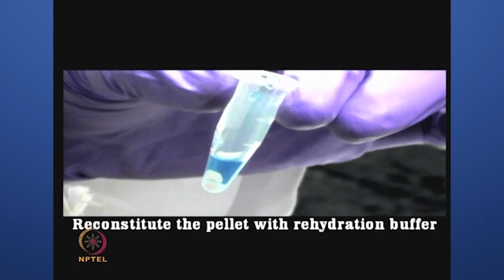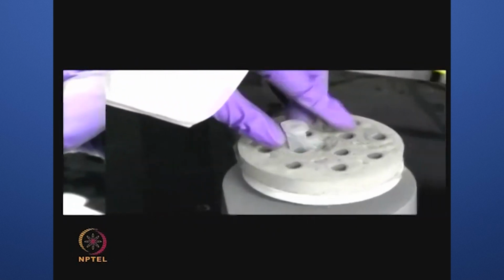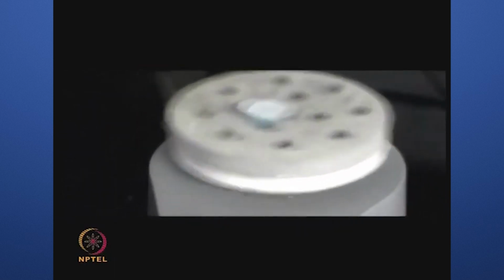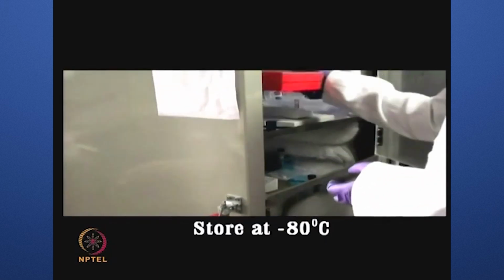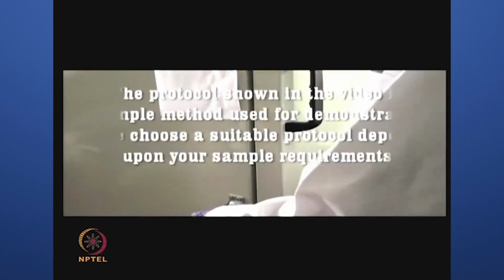Reconstitute this dried pellet with the rehydration buffer. Vortex the tube to ensure uniform mixing. Store the reconstituted protein solution at -80 degrees Celsius until performing the next step of protein quantification.